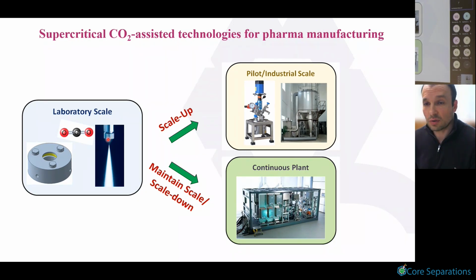But a nozzle, which contains again a small high pressure vessel inside, but a nozzle that can be operating 24/7. So you can be spraying your particles, either as microparticles or nanoparticles, over time. So rather than scaling up the size of your vessels, scaling down into a nozzle will actually help to scale up the whole process, right? In terms of scaling up the throughput, but instead scaling down the size of your reactor. That will allow you to make continuous production of your microparticles or nanoparticles.